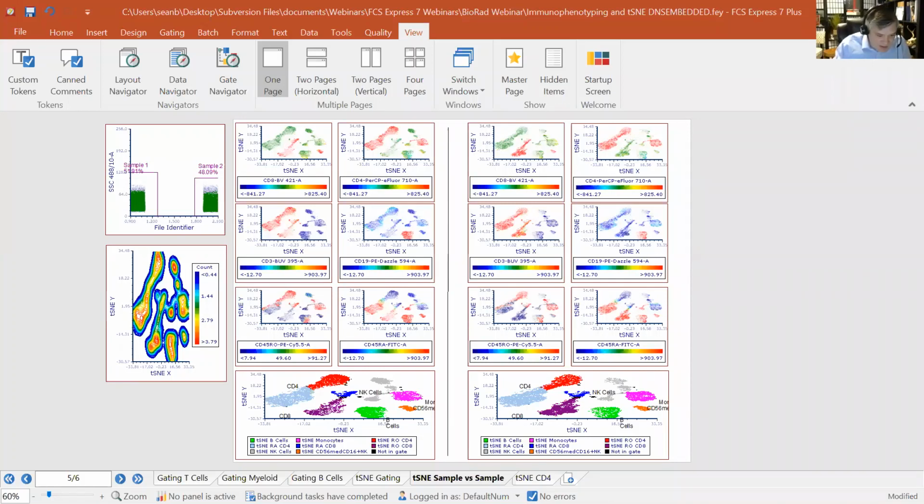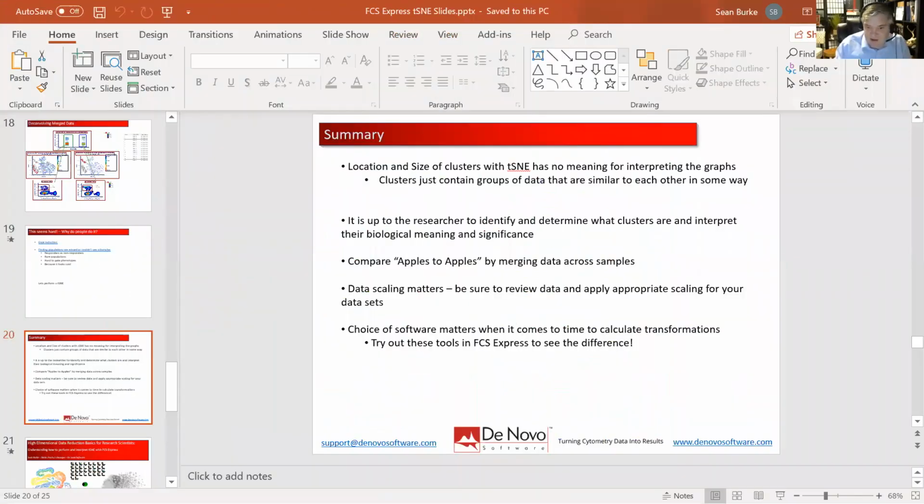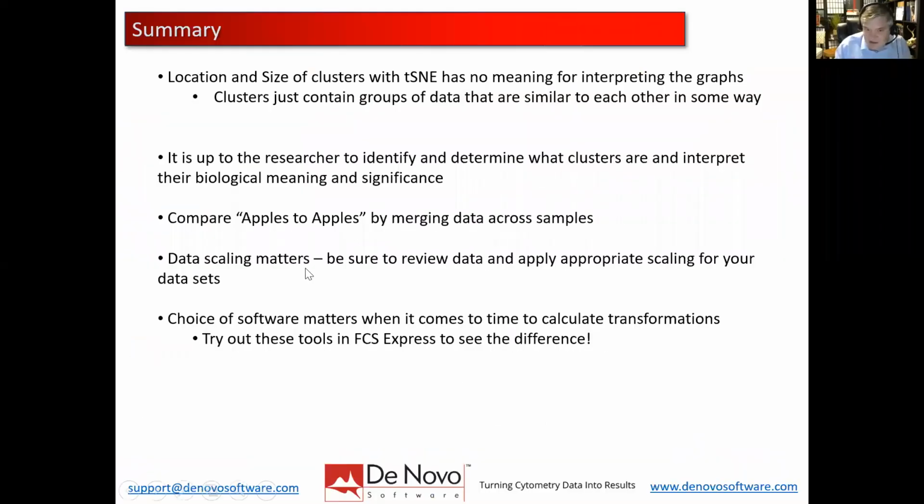So I think there were a few questions that probably came through there, Kathy. Is that correct? Yeah, so you answered the other two earlier, about the MQD, and how when we do our downsampling, it's based on everything and not specifically a parameter. So those questions were already answered.